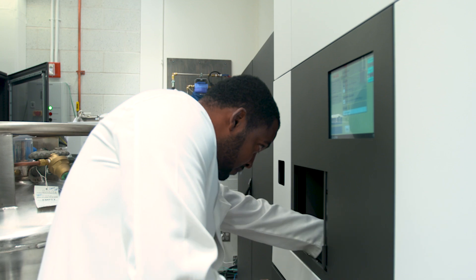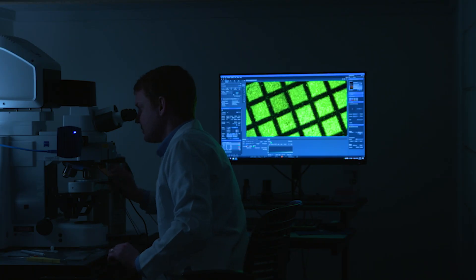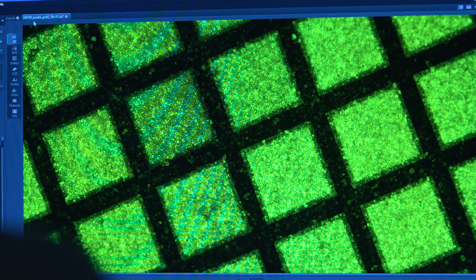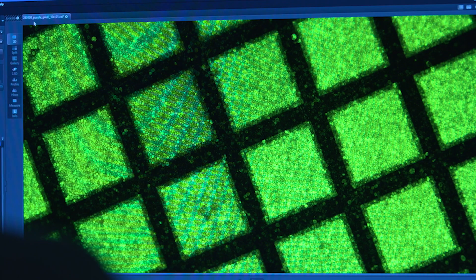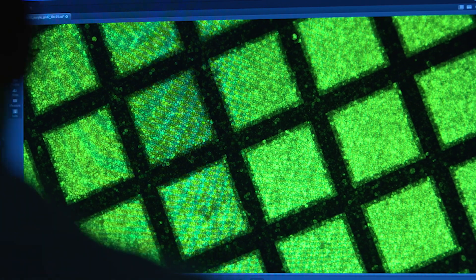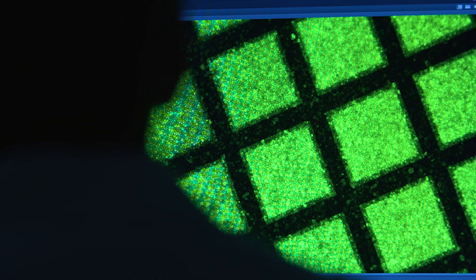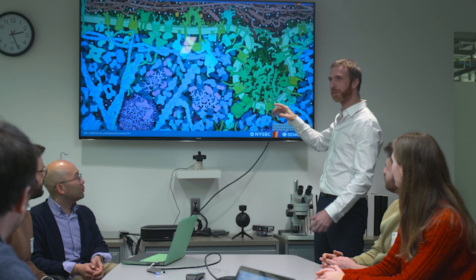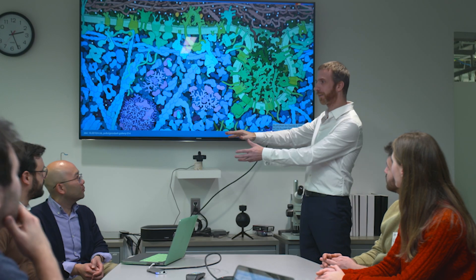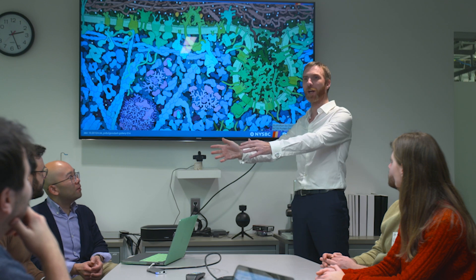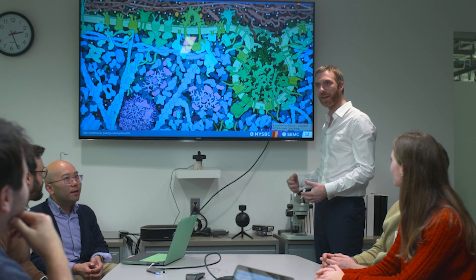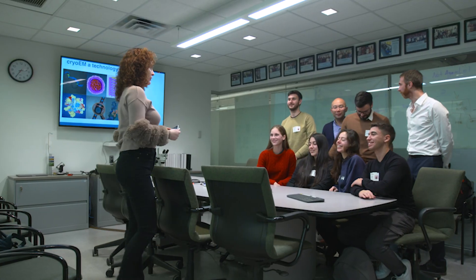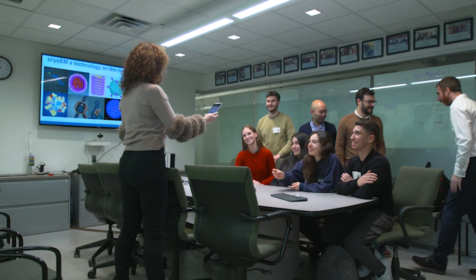When I saw the first images coming off the microscope that I was able to take myself, I was really blown away. That was really a new experience for me to be able to see stuff at that level of detail, which I had never been able to see before. One of the most exciting reactions we get from a user is they've been trying to do cryo-EM, they have their samples, and when they finally get to see their actual particles in the micrograph, they're just beaming.